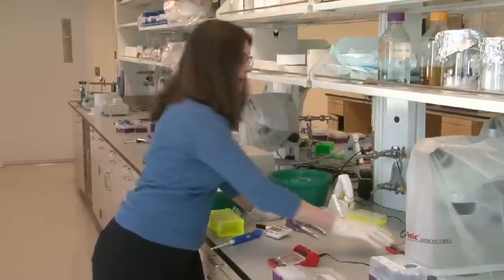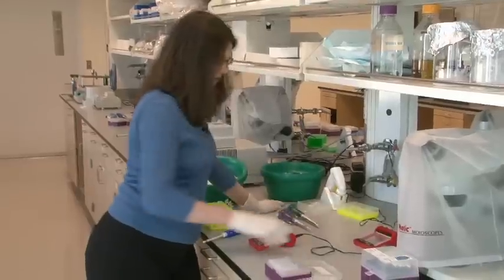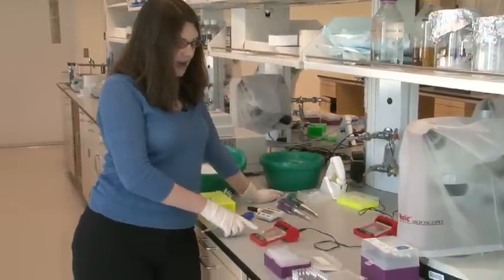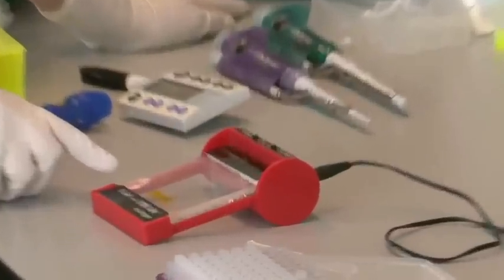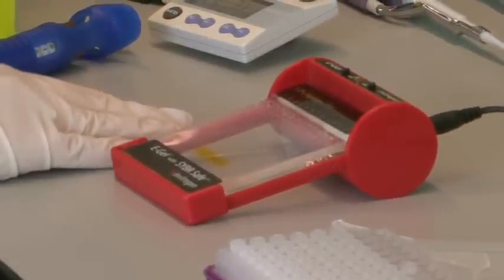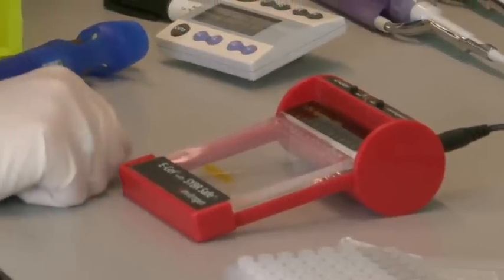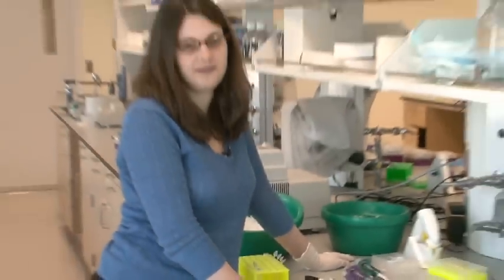This takes about half an hour, and so I actually started another gel for you before we started filming this segment. And you can see that the orange dye is almost at the end of the gel here. So this gel is almost done running. And when it's done running, it'll beep to tell me it's done, and then we're going to take it into the darkroom so that you can see the results.